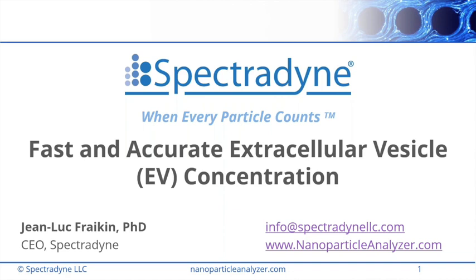I think with any technique, there's some fine tuning required at the limit of detection, because that's right on the hairy edge, right? So we have techniques and methods available for helping you with that, and definitely please reach out to us for that.